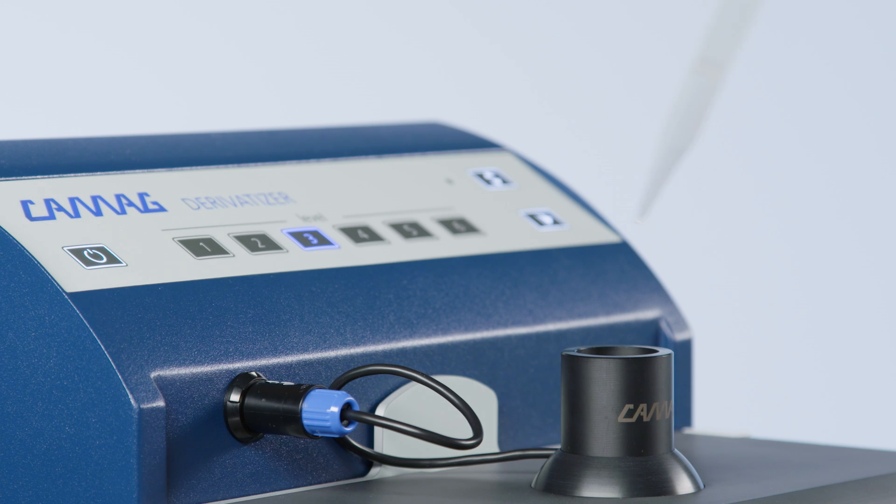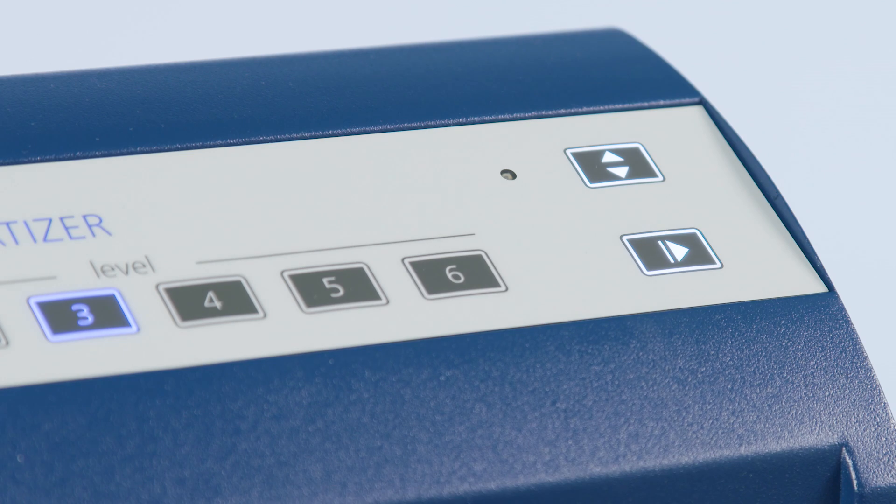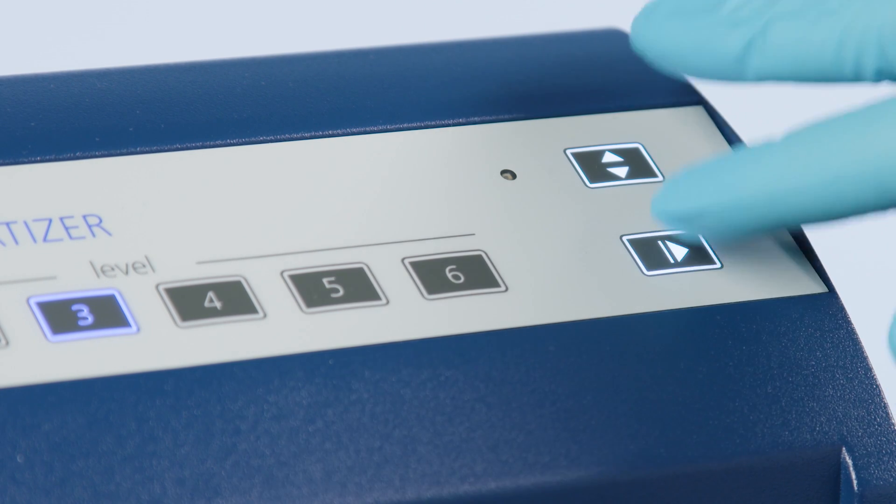Fill the recommended volume of reagent into the nozzle. The spraying process is started by selecting the spraying level and activating the start button.